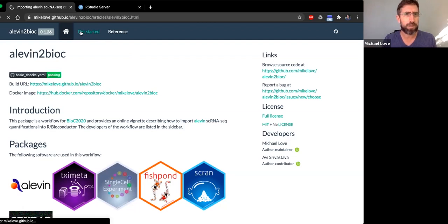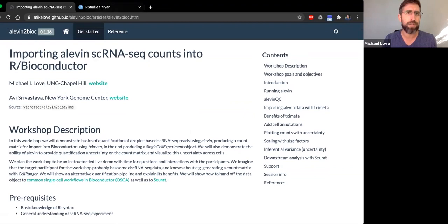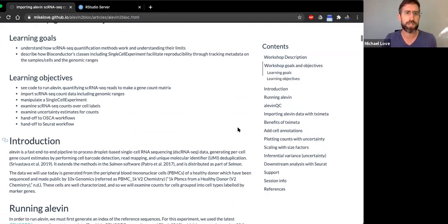I'm going to pull up the tutorial for today, and I'll be driving. I'll start from here and then I'll switch over to the Docker. So Avi, did you want to take over talking about the introduction to Alevin?